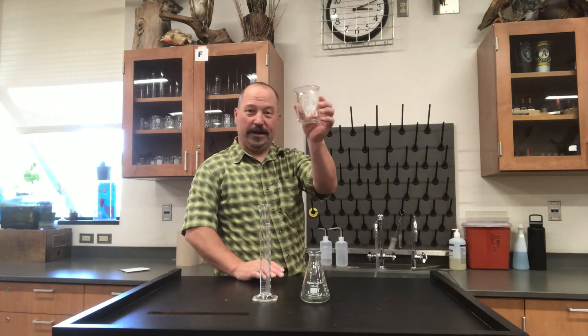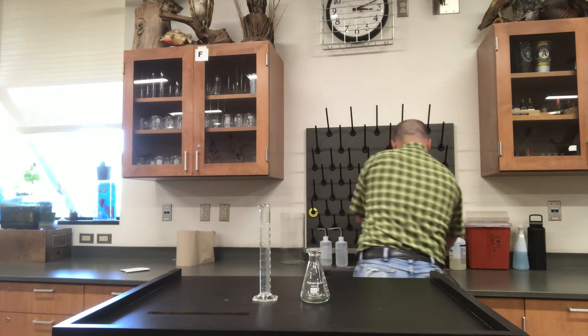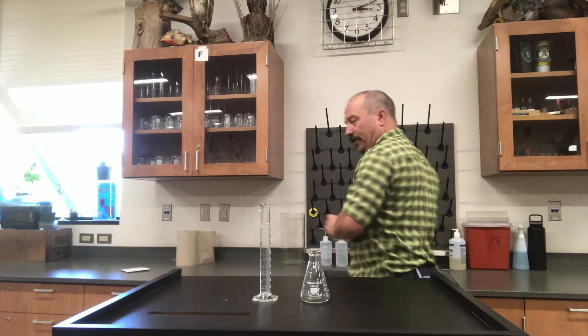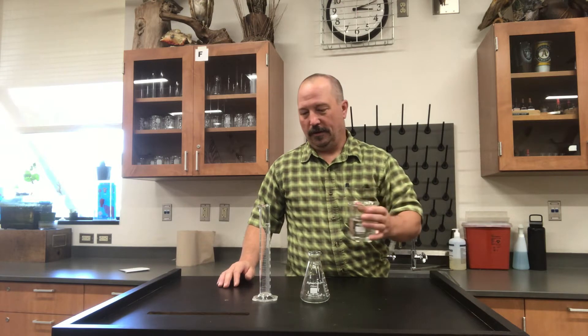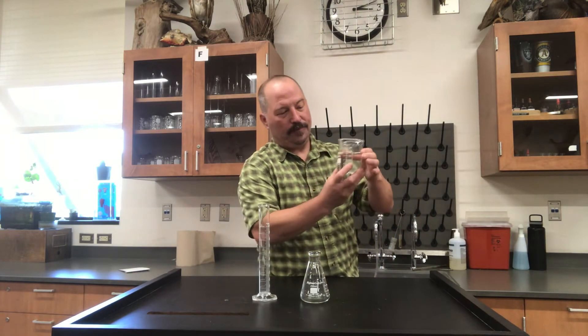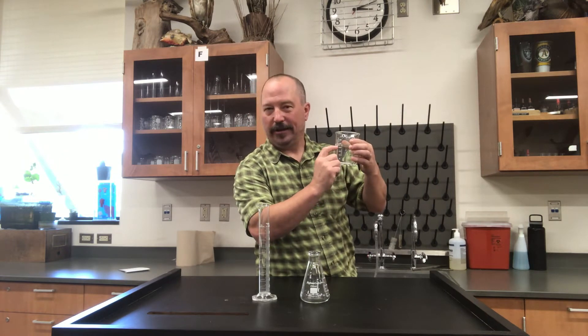Well, this one right here is the beaker, and beakers are really good for getting a volume of water and transferring it to another volume. If you want an accurate measure of volume, this is just an indicator — it's not really accurate.